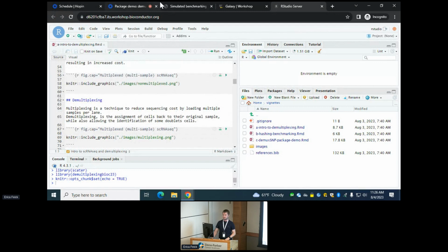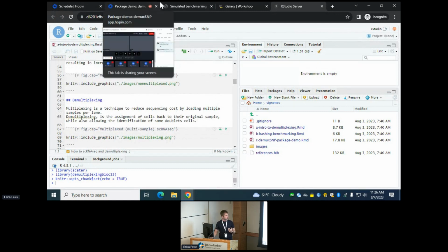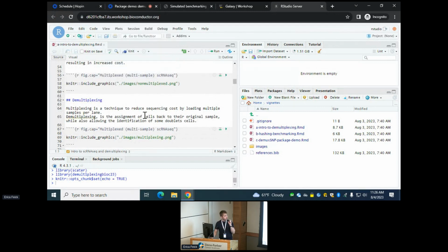Basically, to motivate it, we have lots of different hashing algorithms at the moment that just operate on hashing data. With good quality data, they perform really well. With poor quality hashing data, performance reduces. So we can call some cells with hashing data, but not all of them.